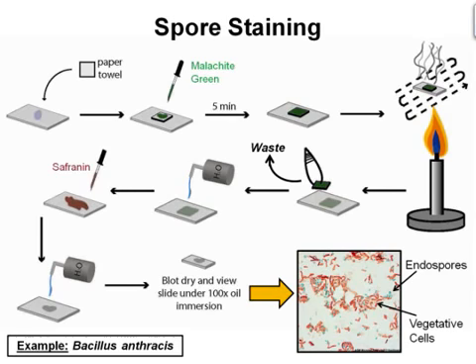The primary dye, malachite green, binds relatively weakly to the cell wall and spore wall. In fact, if washed well with water, the dye comes right out of the cell wall. However, not from the spore wall once the dye is locked in. That is why there is no need for a decolorizer in this stain. It is based on the binding of the malachite green and the permeability of the spore versus cell wall. The steaming required in the procedure helps the malachite green to permeate the spore wall. The procedure is illustrated in this slide.